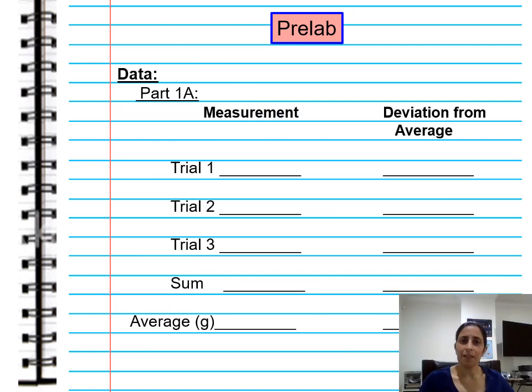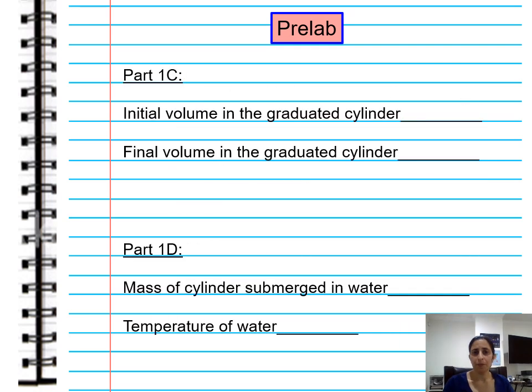And then afterwards, I'd like you to set up the data table. The data tables are also given in your lab manual, but I also put them here so you can just copy mine on your paper in your notebook. Okay, please make sure that they're organized clearly.